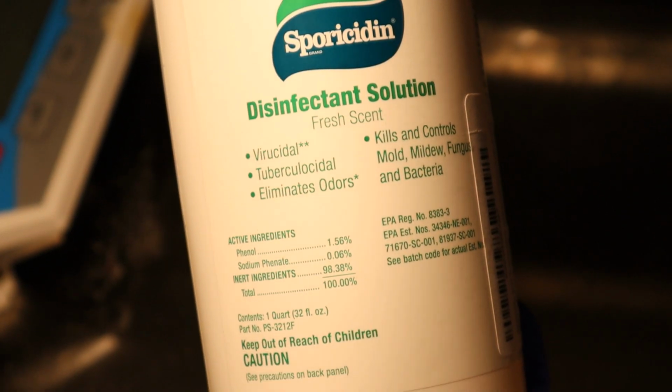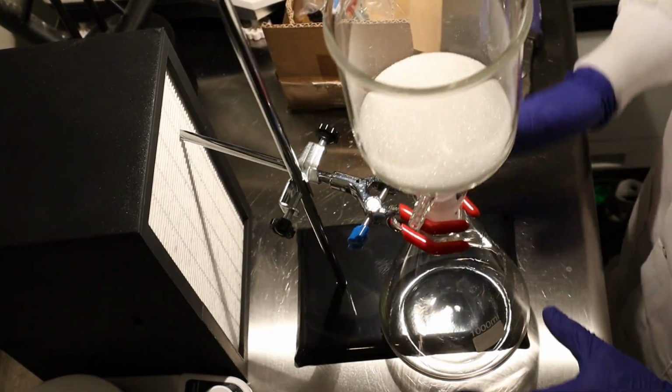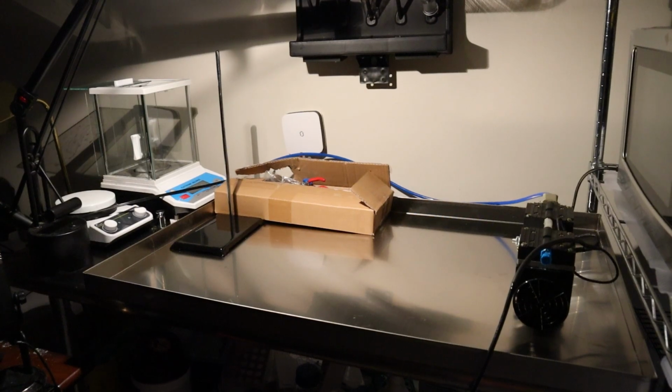I also ordered some better disinfectant, as I was just using 70% ethanol and Sani-Cloth, which still left spores behind, so I used something called Sporicidin, which leaves a film behind that prevents the spores from germinating. I also got a clamp for my vacuum filtration setup, which after some testing proved to be quite effective at stopping it from falling over when bumped. In case spills still managed to happen, to ensure they wouldn't run off the table, I got a large metal spill tray to cover my entire table to act as a secondary spill containment. I could now handle spills much more safely.